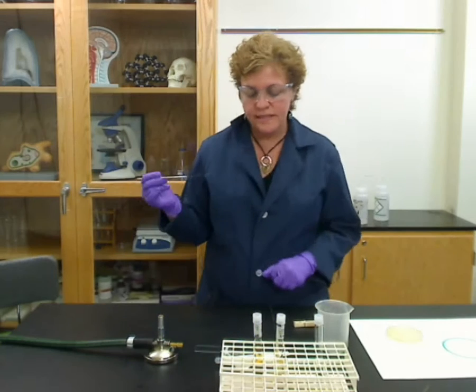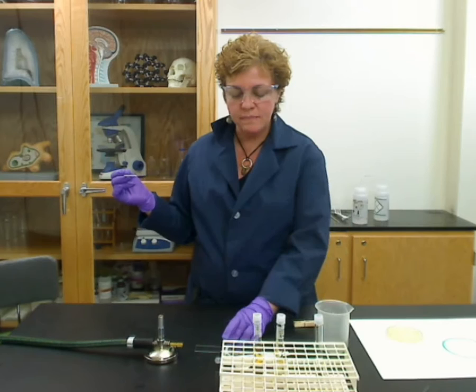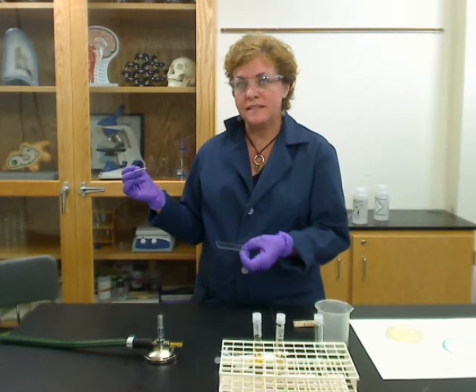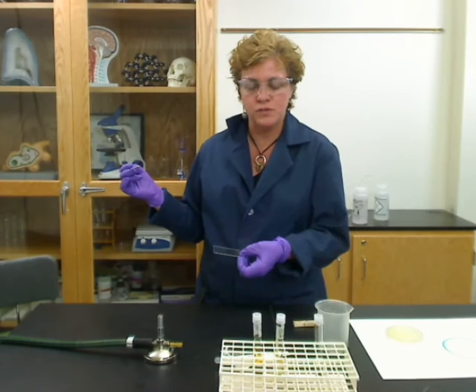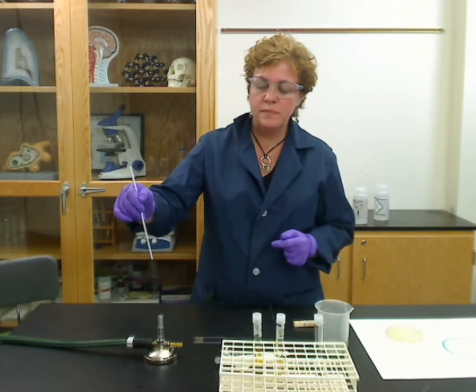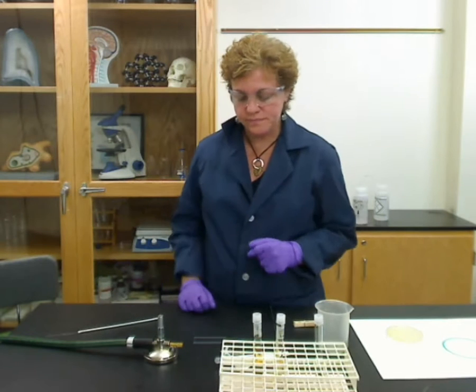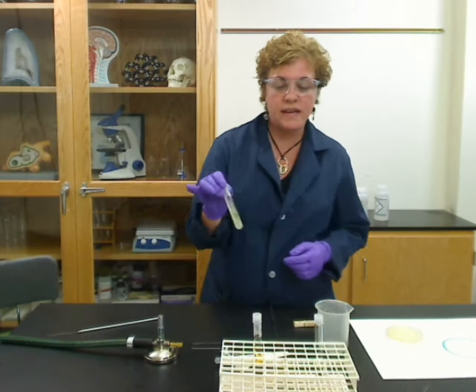Then set it to dry for about two minutes. Some people have slide warmers. You can't take a wet smear and put it over a flame, because you're basically frying your bacteria and won't be able to see the morphology as it's supposed to look. Once done, remember to always flame your loop before you put it down, and make sure to set it on something other than plastic because the plastic will melt. That's how you make a bacterial smear from an agar slant.